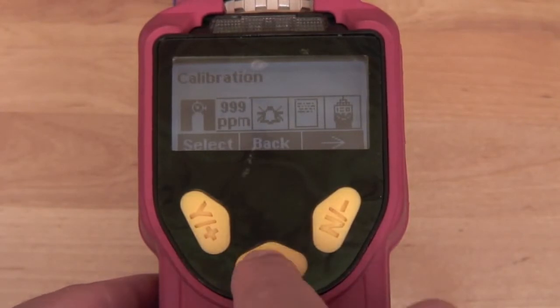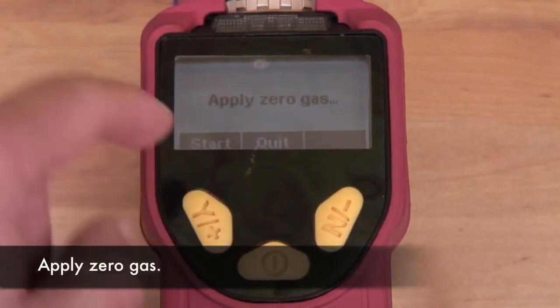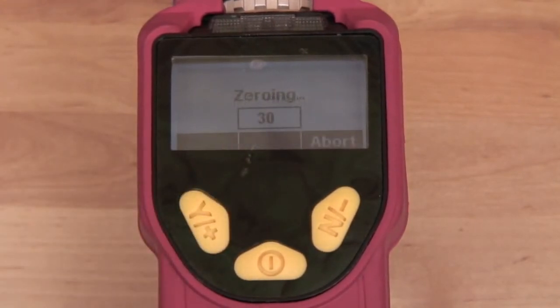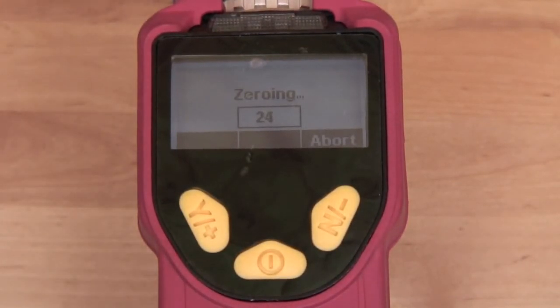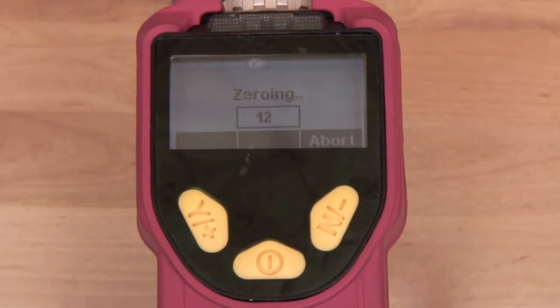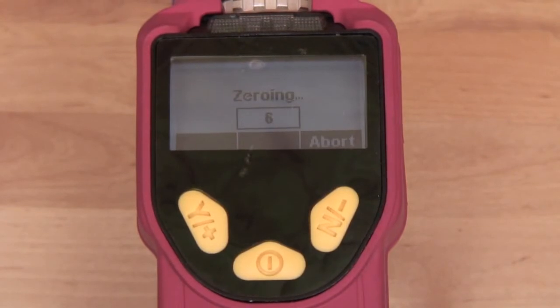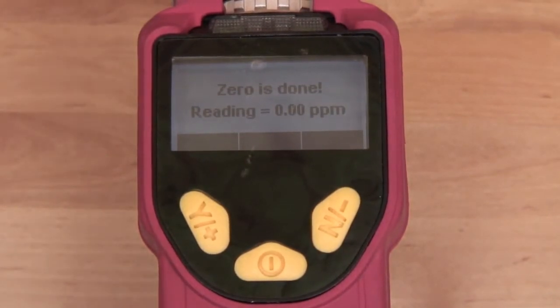Select Yes to enter the calibration mode, then select Yes again to enter zero calibration. Attach your zeroing kit with charcoal tube or zero air to perform zero calibration. Our reading is now zero parts per million. Our zero is complete.